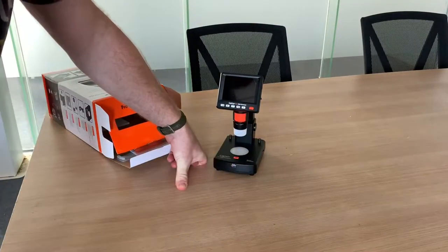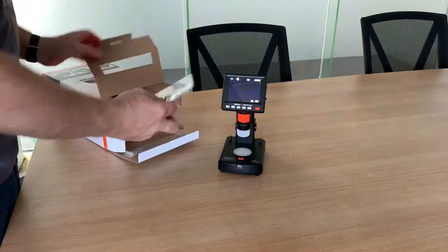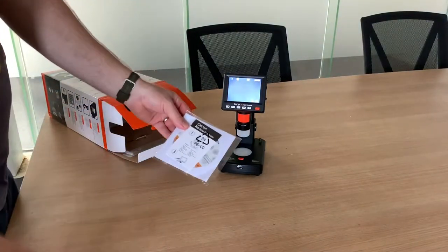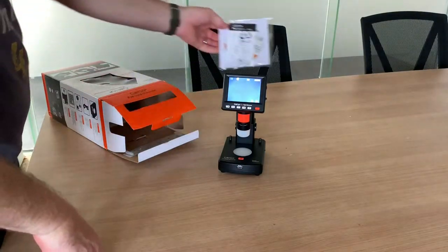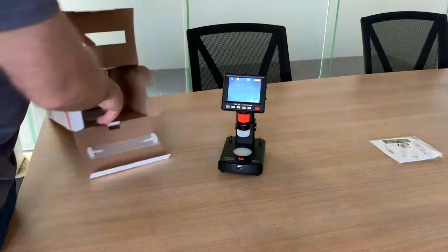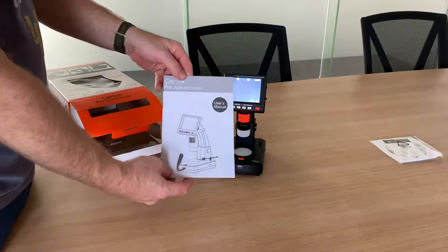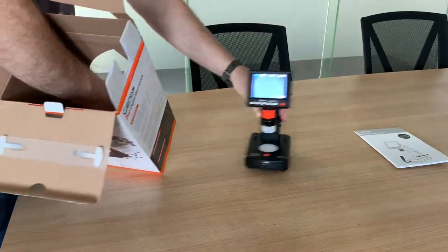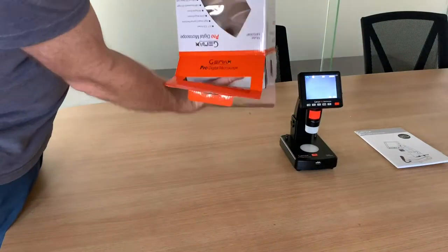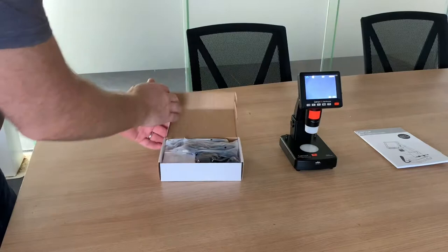Turn it on. This CD here is your instruction CD - includes everything you need to know. It also comes with the instruction booklet, and then in the bottom you've got your accessories package with a whole assortment of goodies.